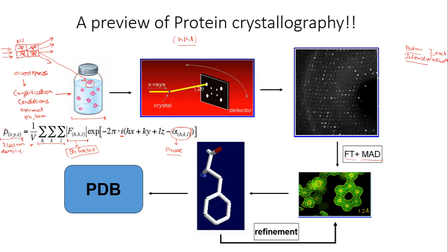So, long story short, after you obtain the position of each spot from your X-ray crystallography experiment, the objective is to create electron densities, and that is usually done by implementing this Fourier transform.